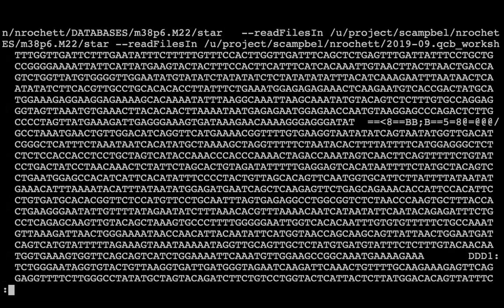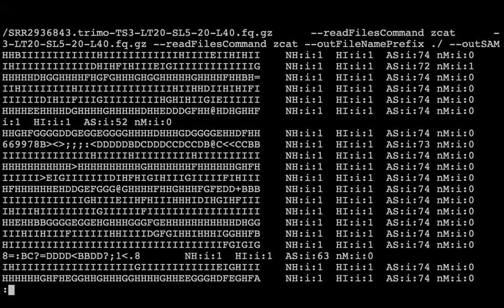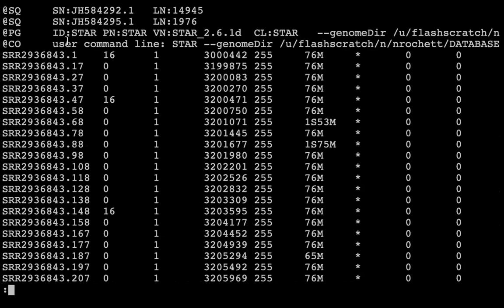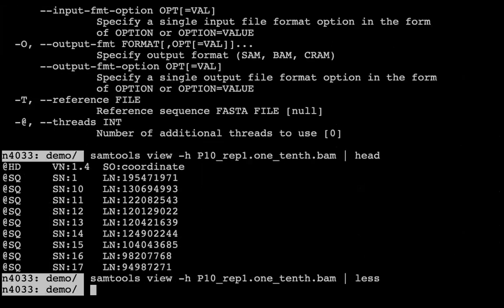If I go right, then I can see I have my sequences, and then a number of additional fields that we're not concerned about. But basically, this is one read name, and this one is actually a reverse read. Oh, it's mapped to the negative strand, without indels. Yes, basically that's a basic way to use BAM files and SAM files.